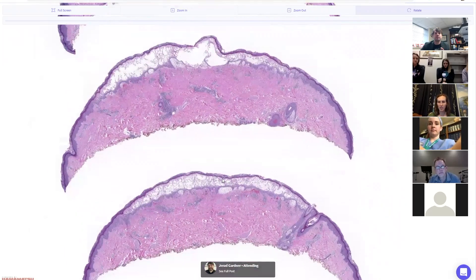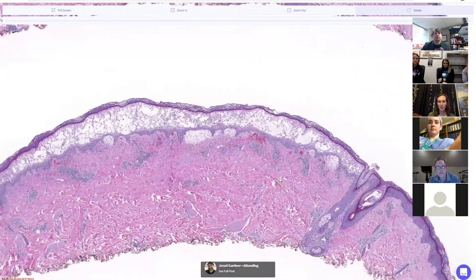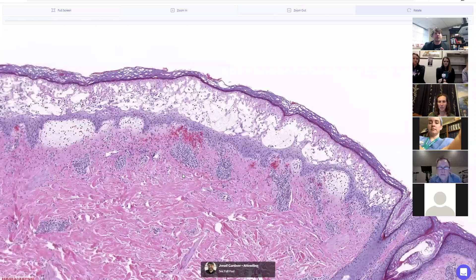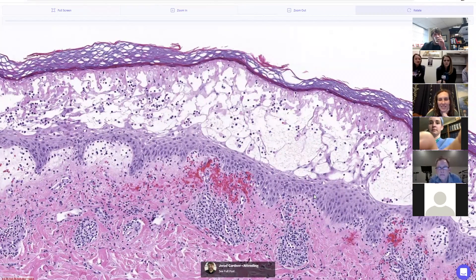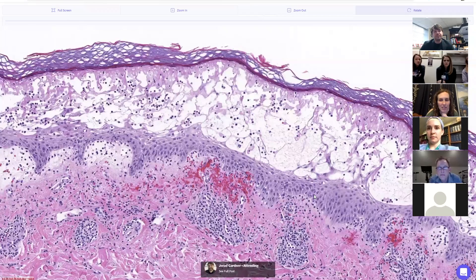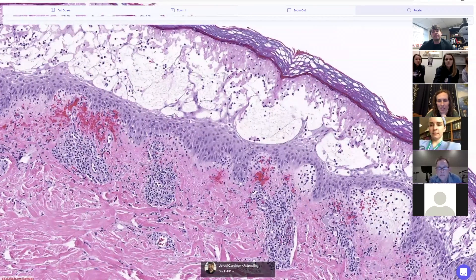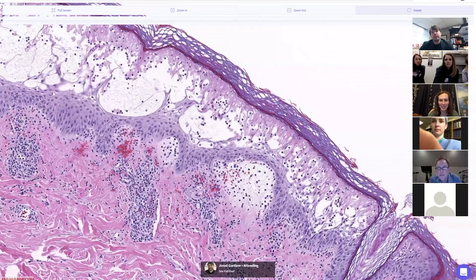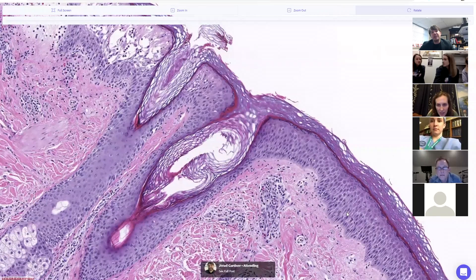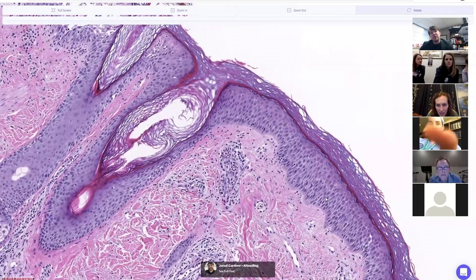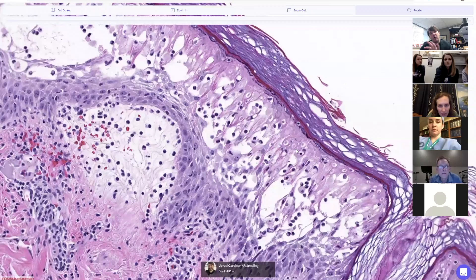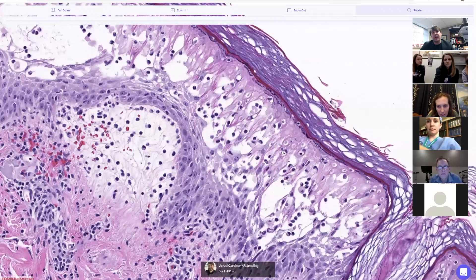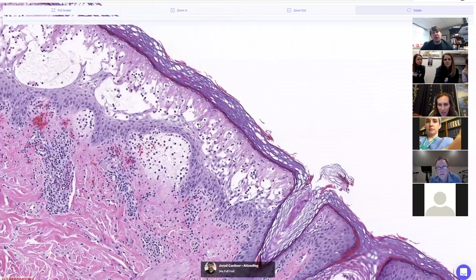Here's the low power view — we'll go in for a closer look. The skin adjacent to the lesion is a little spongy but relatively normal, and then right where this lesion is you get a whole bunch of dying keratinocytes. It looks like this probably happened pretty quickly.